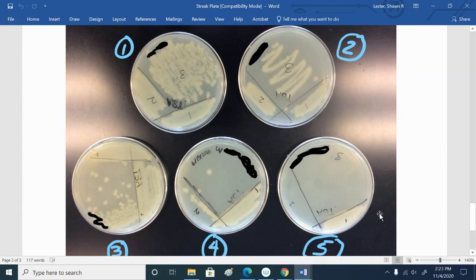Bad. It's bad, right? So they put the bacteria in zone 1, but then they missed, right? They didn't actually go into zone 1, they missed, and so they didn't grab anything for zone 2. And since there was nothing in zone 2, they couldn't grab anything and spread in zone 3. But these are all common examples of problems that happen when you do a streak plate.